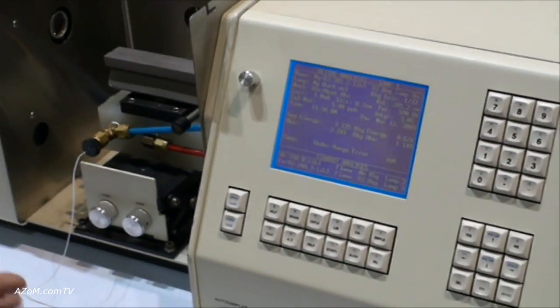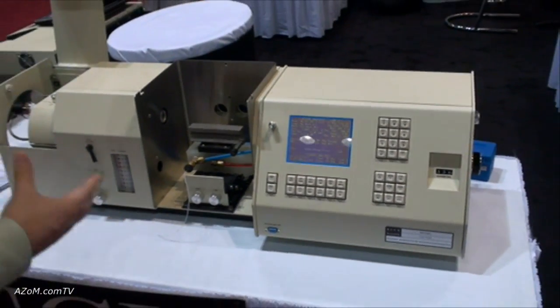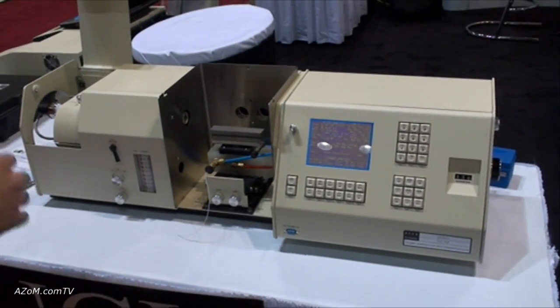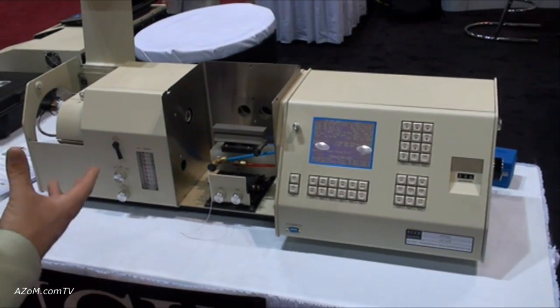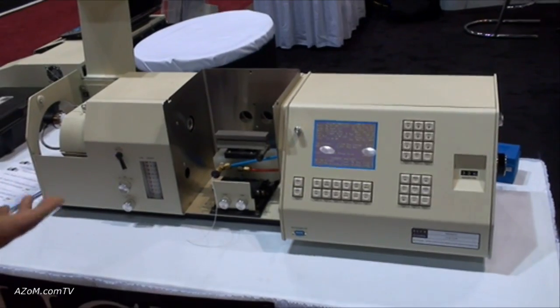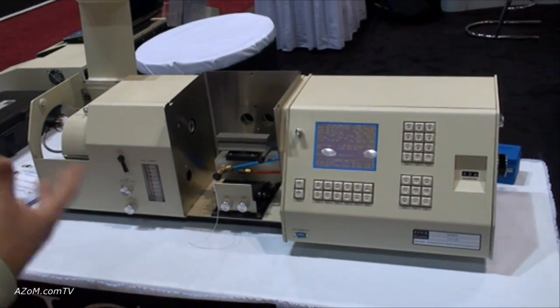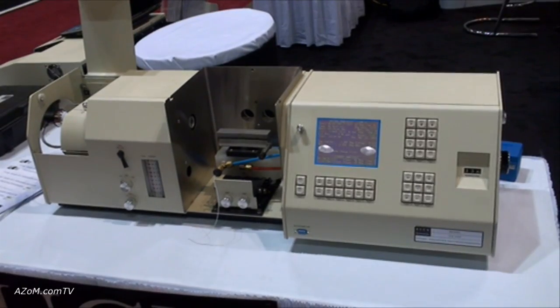And because everything is manual, a lot of light industry uses our system. You don't have to be a chemist to use our system. A lot of plating bath companies will use this particular setup to do chrome analysis or nickel analysis of their plating baths before and after the bath's been used.